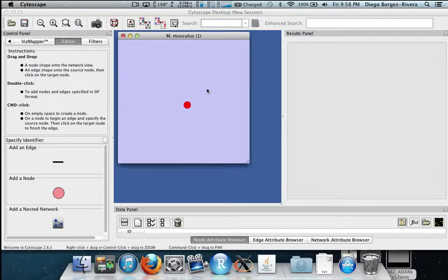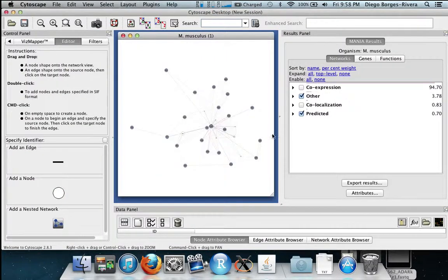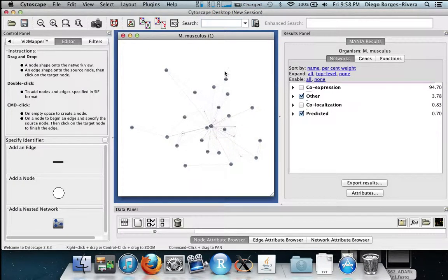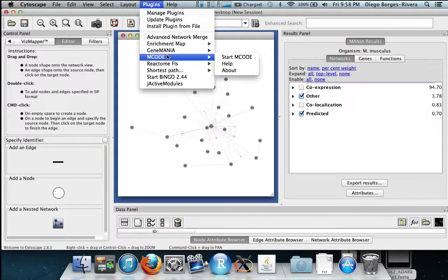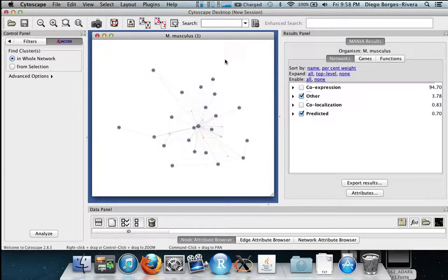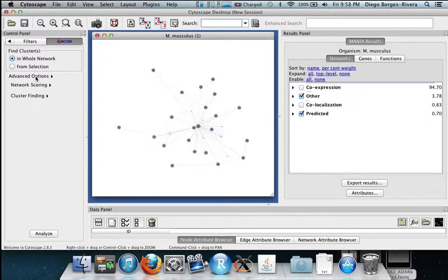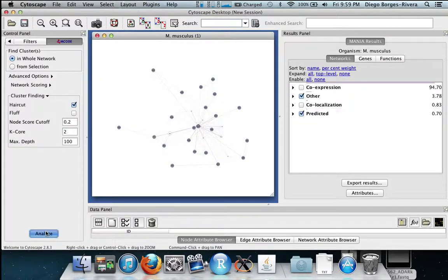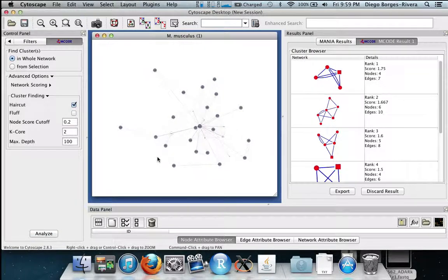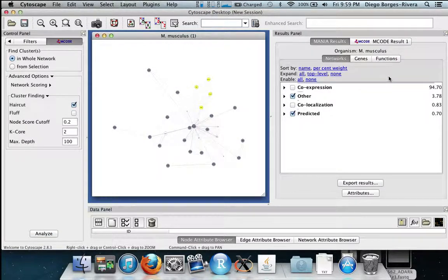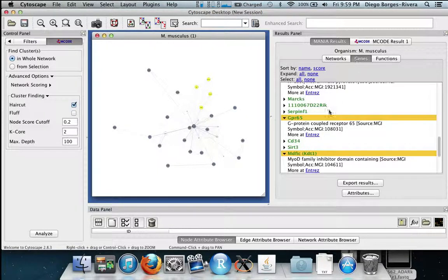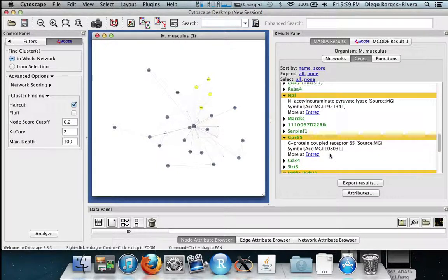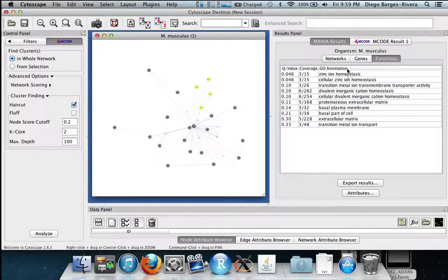With the network done you can see it loaded up here. We now want to find highly interconnected sub-networks by using the mcode plugin. By going to plugins, mcode, and then start mcode. We also want to make sure the haircut checkbox is checked. We then hit analyze. This will produce a results panel with all the highly interconnected networks. In this case we pick number 1. You can see it highlights it and extra data and information is also shown in the genes and function tabs.